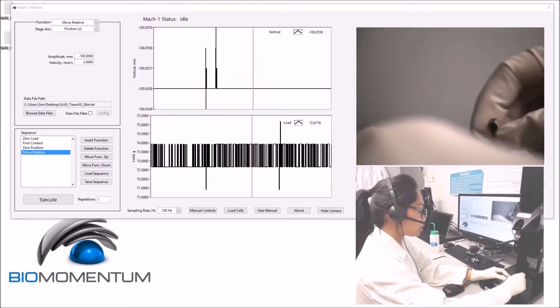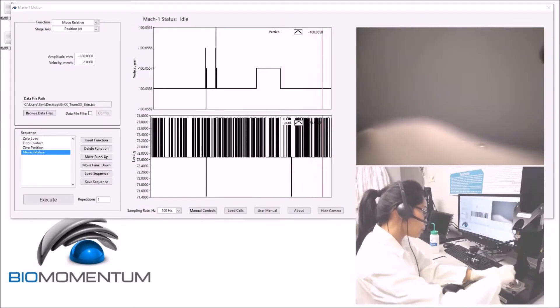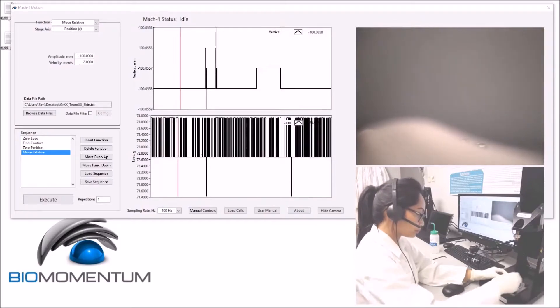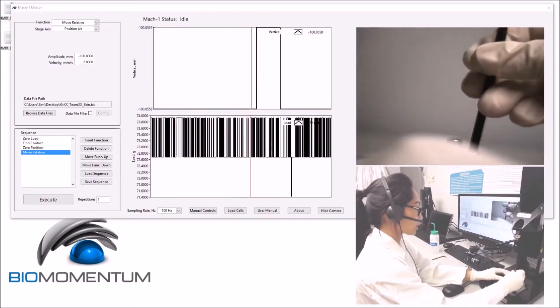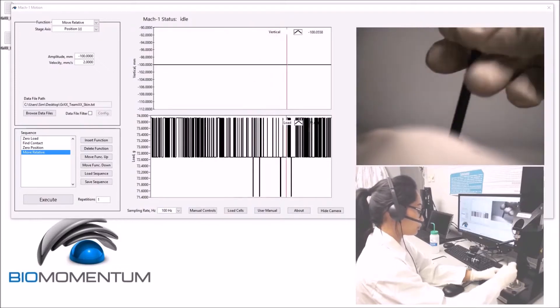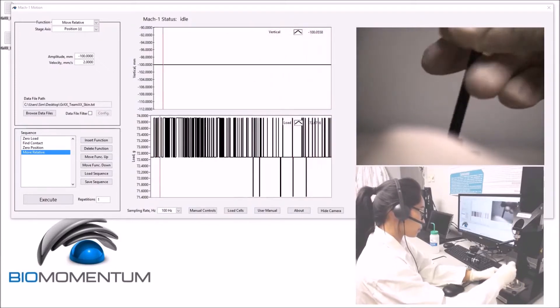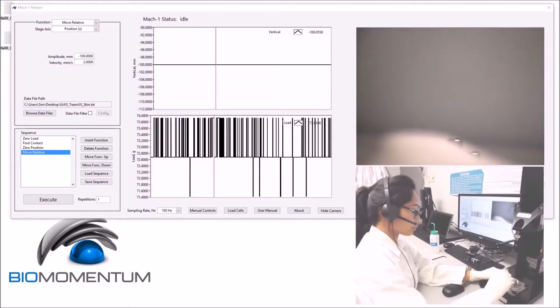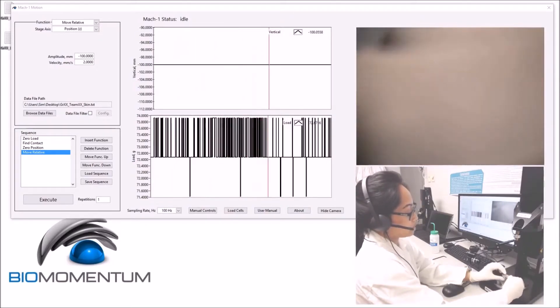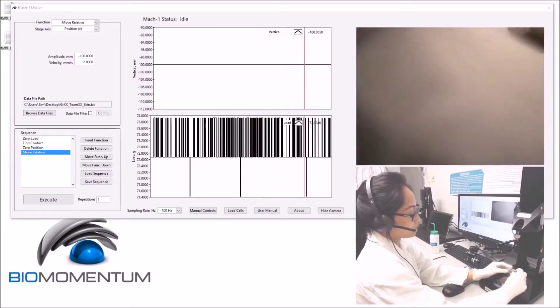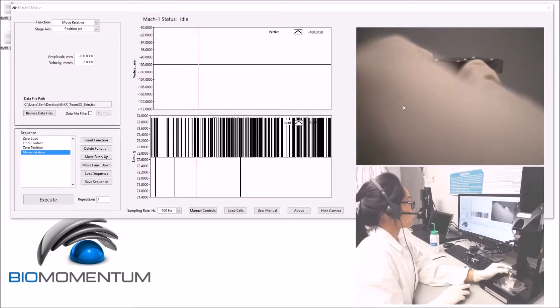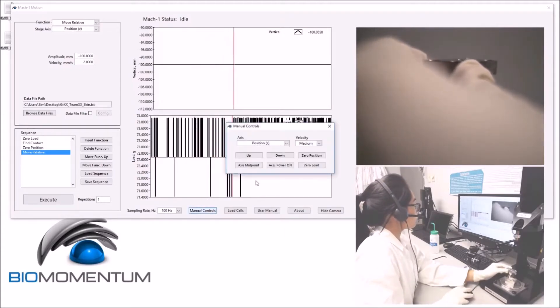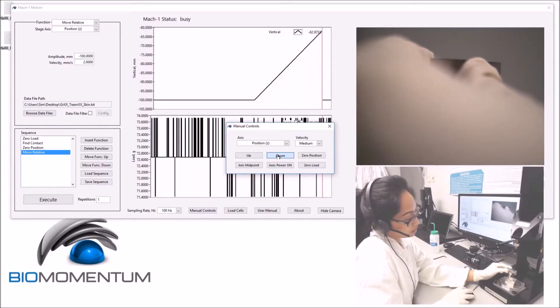Secure the bottom tensile grip to the sample holder, and secure the top tensile grip to the sample holder.